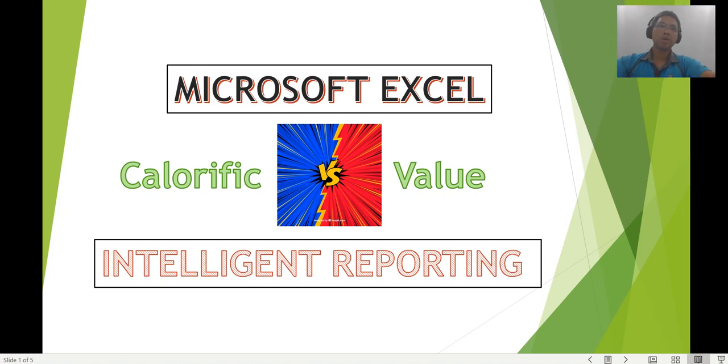Hi there, in this video, we'll go through the steps to use Microsoft Excel and Intelligent Reporting for heating value or calorific value calculations. Stay tuned.